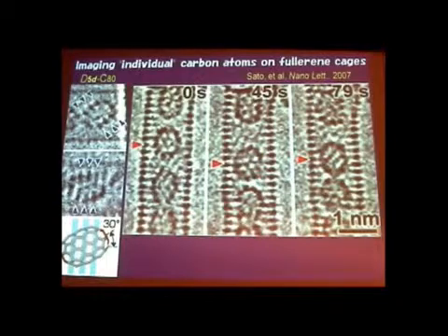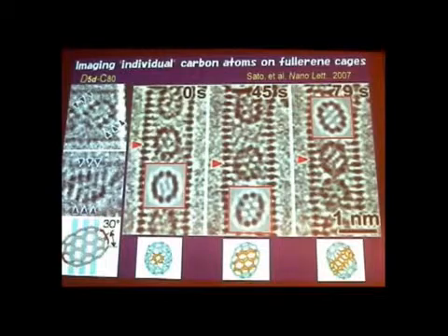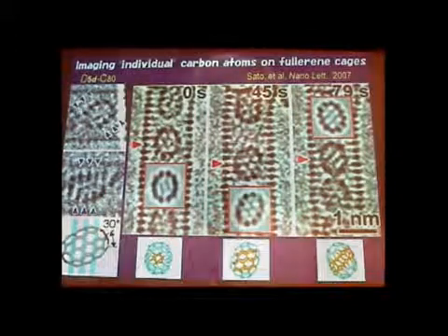And if you look at some of them, then we have typical contrast. In this particular case, maybe you see C80 moving around. So in a certain direction of projection, you see this 1, 2, 3, 4 sort of empty area in the molecule. So this is seen as a white region. This is the simulation. So in that region we have more carbon lattice. More means maybe 3 carbon lattice. So in this way, we can do molecular structure analysis directly from the images.